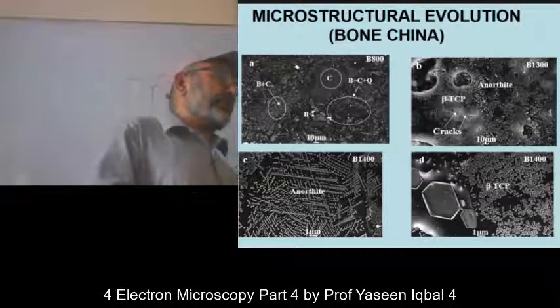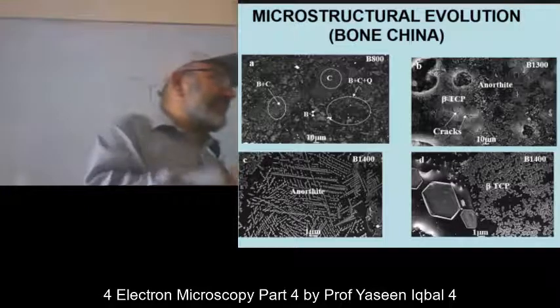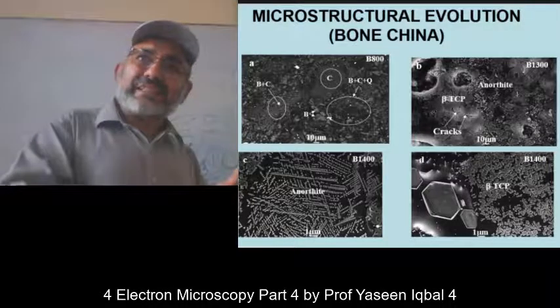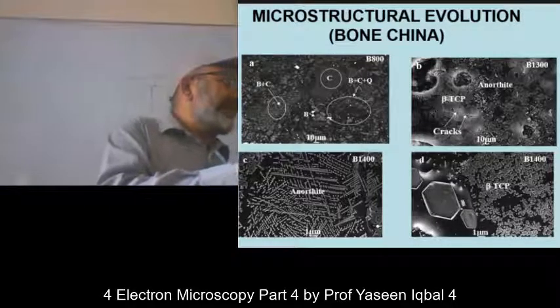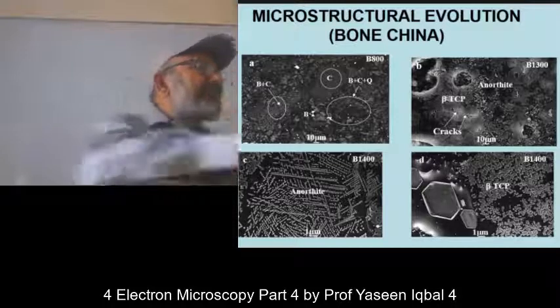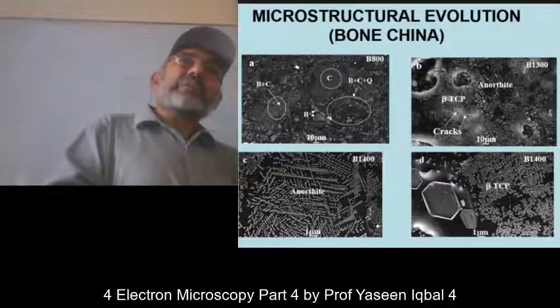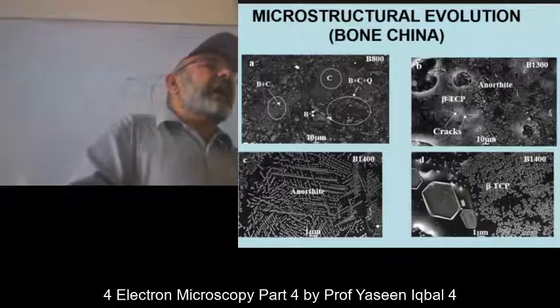And in the microscope, you bring a small stone from the mountain, then cut it into a small 2-3 centimeter piece, then grind it up to 100 micrometer thickness, then drill out a 3 millimeter diameter ring, then dimple it up to 25 micron thickness, then mill that surface with the argon ions to get a 20 nanometer thin area, and that 20 nanometer thin area will be also less than 1 millimeter.